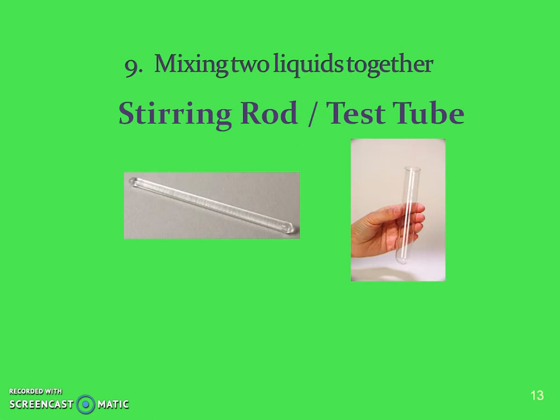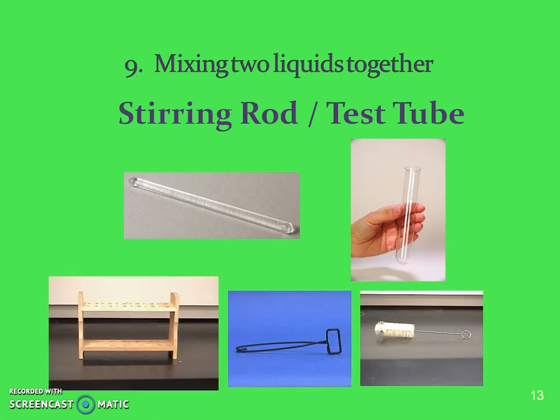We're going to mix things together in a test tube to see a reaction. A test tube rack holds the test tube for stabilization when you're not using it. A test tube holder is used to hold the test tube while heating, and of course a test tube brush to clean it.